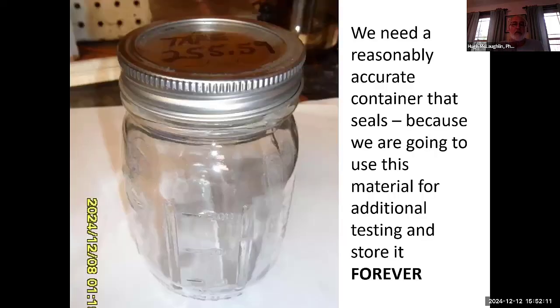And therein lies your first layman science step, which is get yourself a vessel that is calibrated. In this particular case, we happen to have a canning jar, which has the milliliters written on the side. Not a lot of significant figures, but we won't need those.